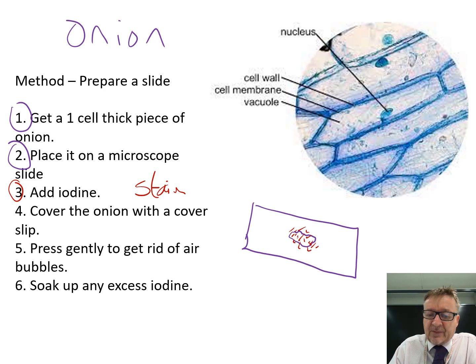Then get a small piece of glass called a cover slip and place it over the top. The best way is to rest it at one point and then lower it down gently.